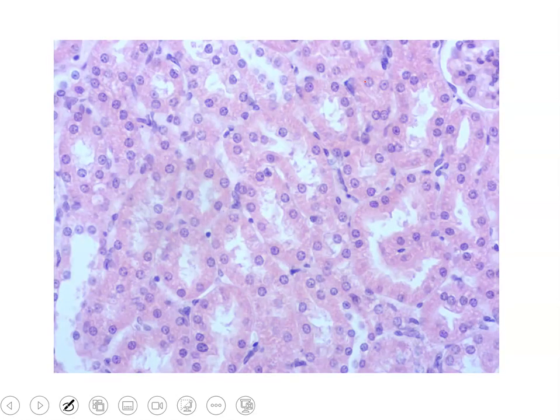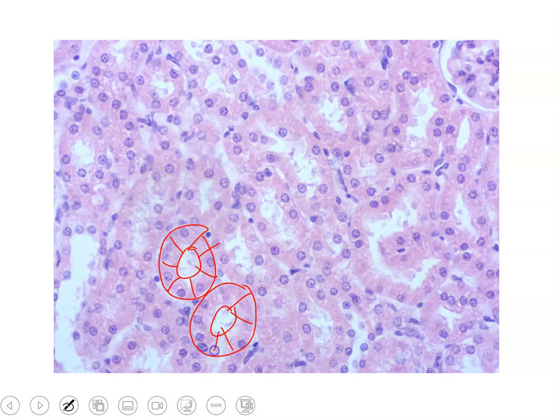More kidney slides. Look for your little donuts here. There's the lumen or space within the kidney tubules, and donuts being lined with our simple cuboidal epithelium. I say they're donuts just because they look like donuts. These are actually the renal tubules within the kidney. Say donuts, lifesavers, however you like to perceive them, but again, made up of a simple cuboidal epithelium.